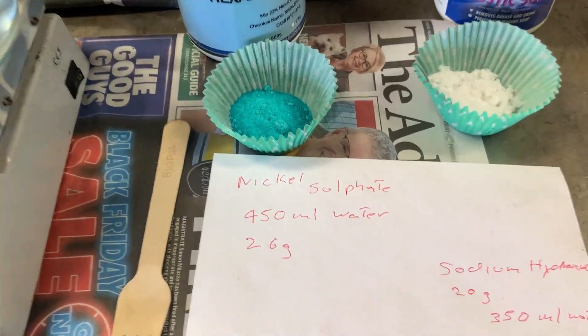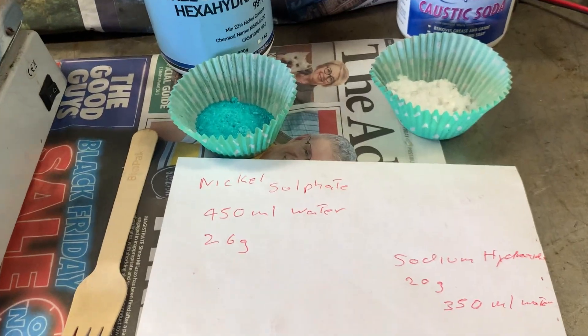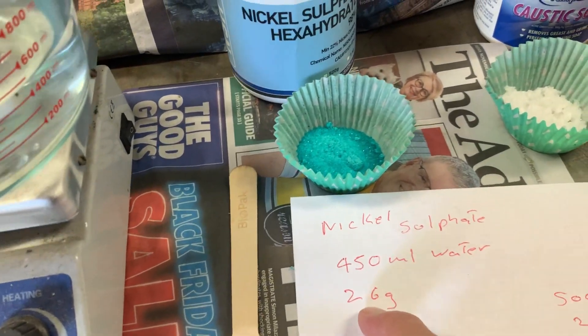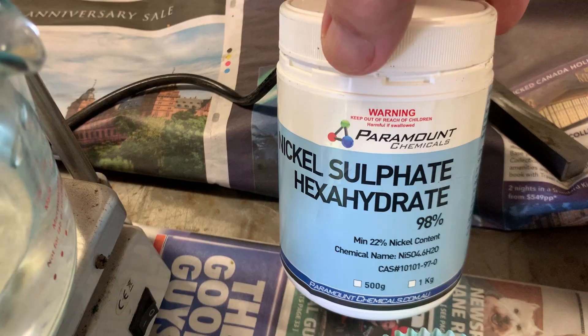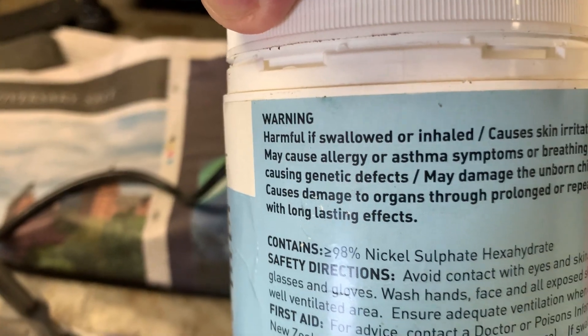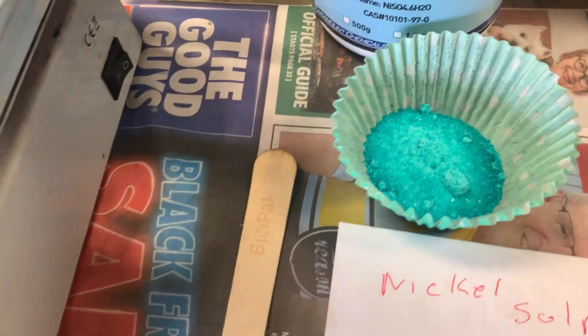Welcome back everybody. Today we're going to learn how to make nickel hydroxide for the nickel-iron batteries. First you'll need 26 grams of nickel sulfate hexahydrate, which comes off of eBay. Read the warnings on the back — do not inhale, wear a mask when putting it into the container and crushing it up.